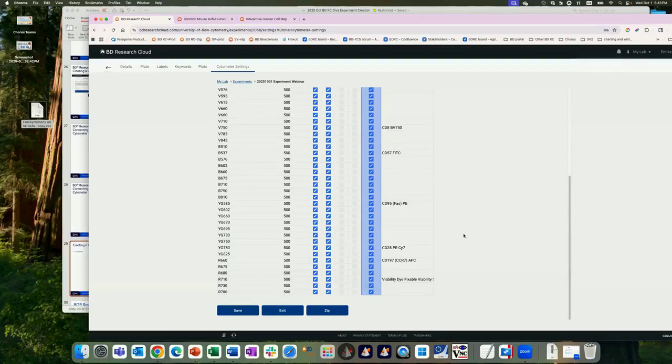Once you import the experiment into Diva, if you start acquiring right away and performing tasks, you shouldn't run into any issues. What we have seen is that if you import the BDRC experiment into FACSDiva and then close the experiment right away, it will lose some of its attributes. And the reason for that is that the BD experiment is just a skeleton.